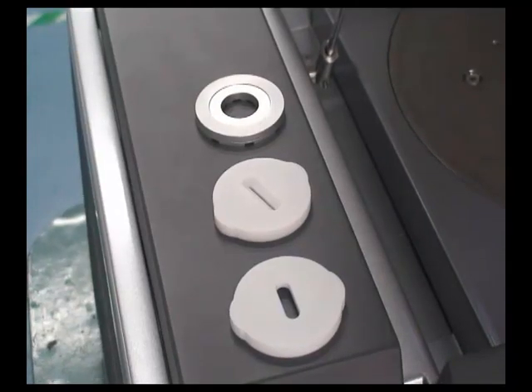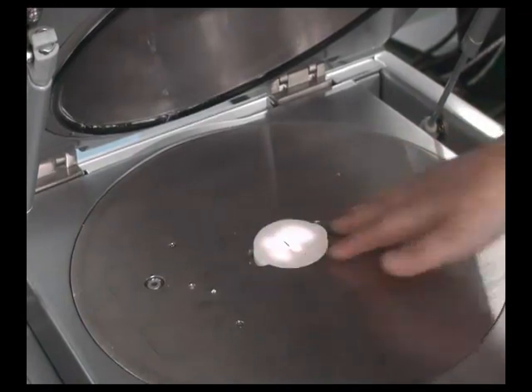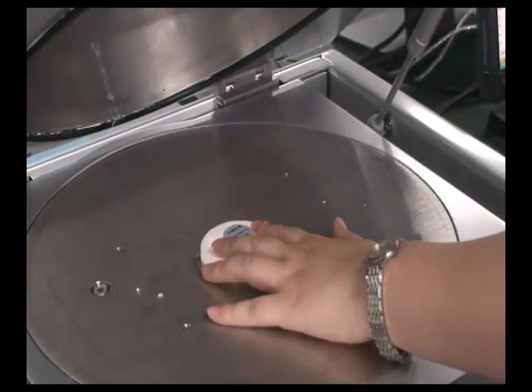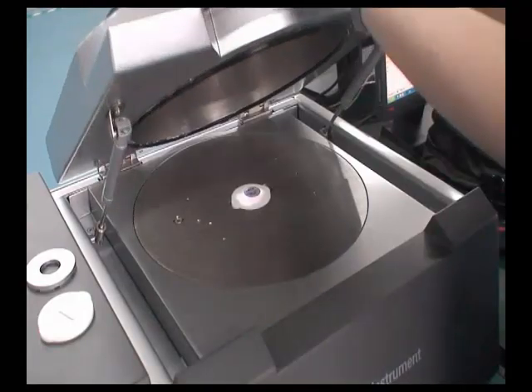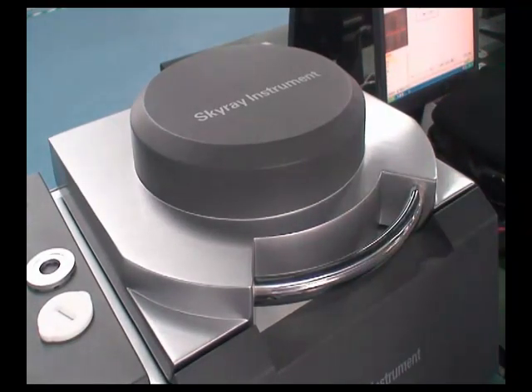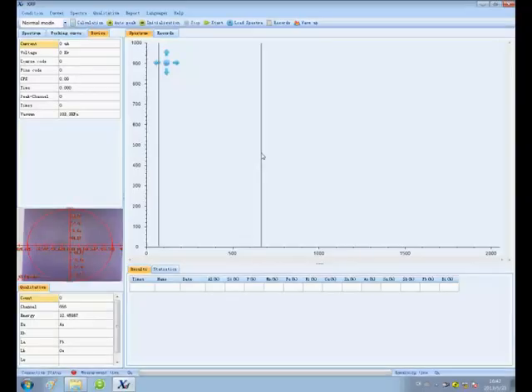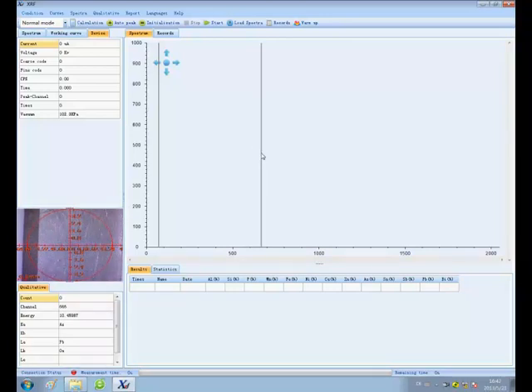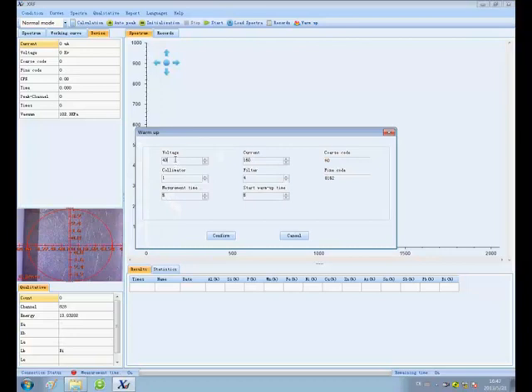Put in a suitable sample holder and then place a silver sample for warming up and initialization. Click Warm Up — a dialog box will pop up. Set the parameters and click Confirm.